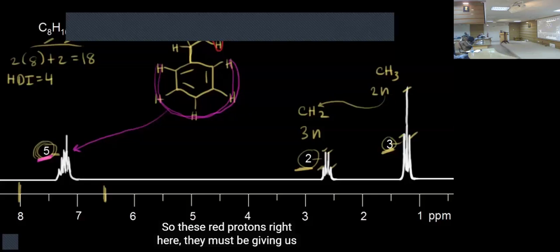You know that this triplet is 3 protons because of the intensity, the integration value. That's why integration is important. That's why I told you in the previous example that NMR people are technicians. They just do it by their experience of thousands of NMR they have done, but they are not sure.